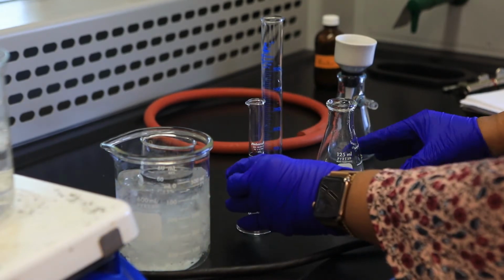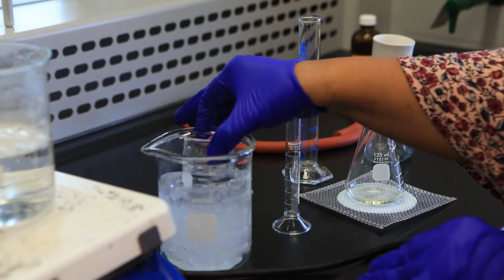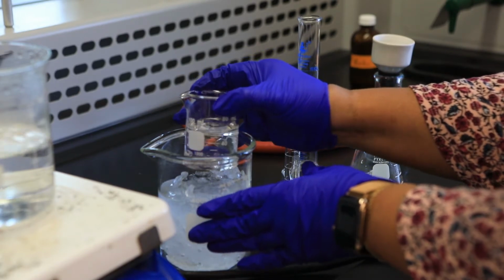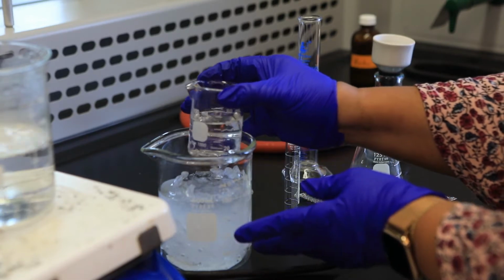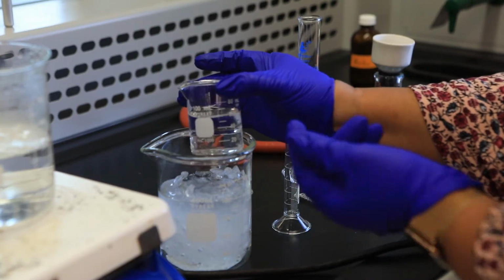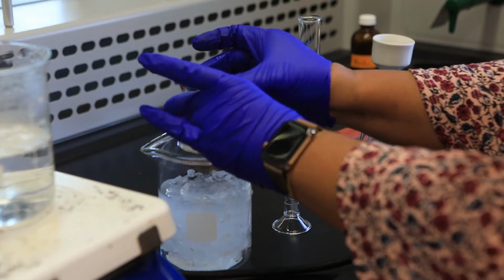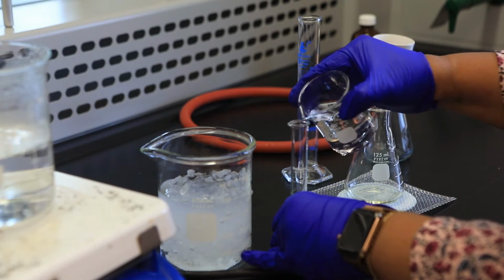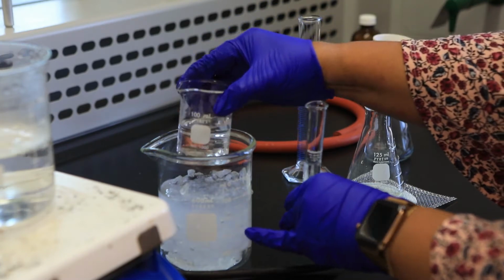In chemistry, a lot of our experiments oftentimes require ice cold water. In order to make this ice cold water, you will need to first make an ice bath. That just involves getting some ice and water. Then, with a beaker or a graduated cylinder or an Erlenmeyer flask, you'll add your solvent and place it in to cool. This has been cooling for approximately, honestly, 20 minutes. So I'm going to obtain 10 mLs of my ice cold, or chilled, water.